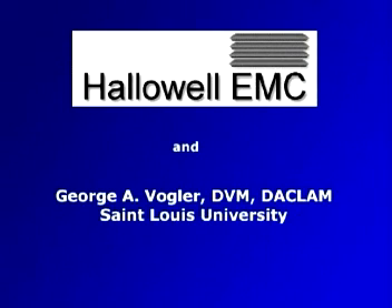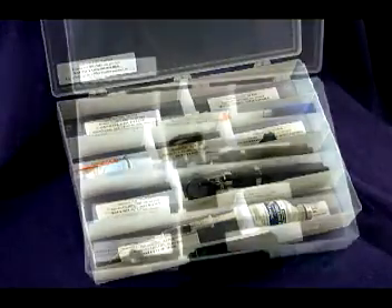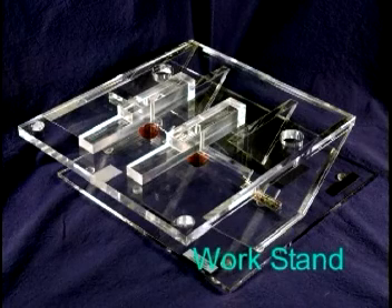Hallowell EMC, with our cooperation, has assembled intubation kits for rats and mice, each containing the various items needed to make intubation a much more manageable task. In addition to the kits, a work stand allows the mouse to be held securely in a comfortable position as the intubation is performed.